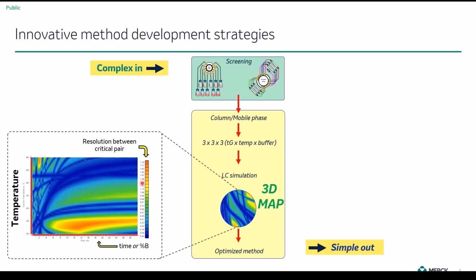In our group, we decided to utilize more and more often a dual approach in which we combine automated screening platforms in order to analyze the most comprehensive set of experimental conditions to determine which kind of combination of columns, stationary phases, which chromatographic technique is the most suited for a given example.